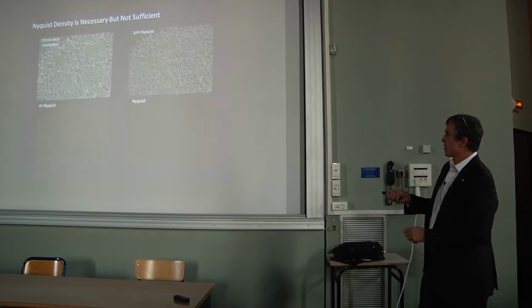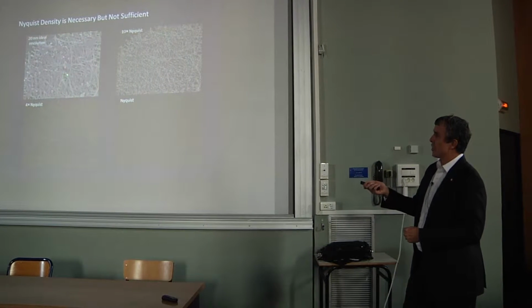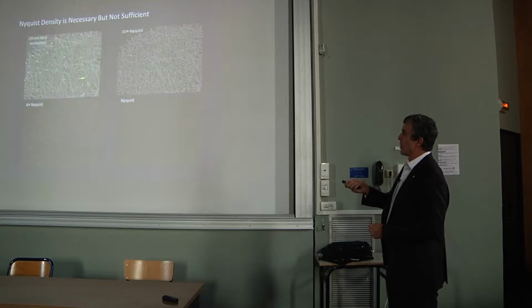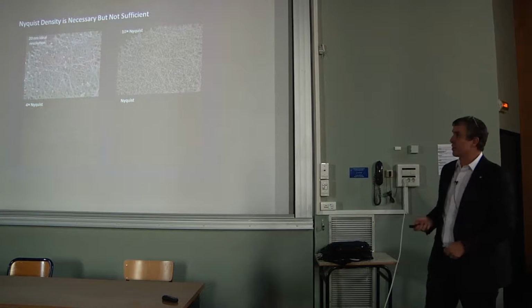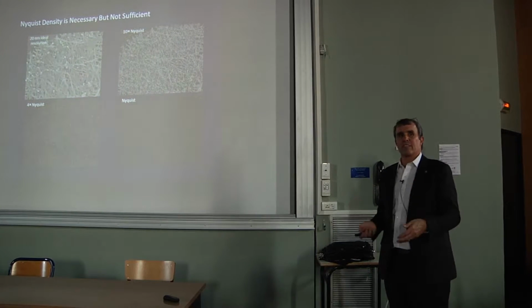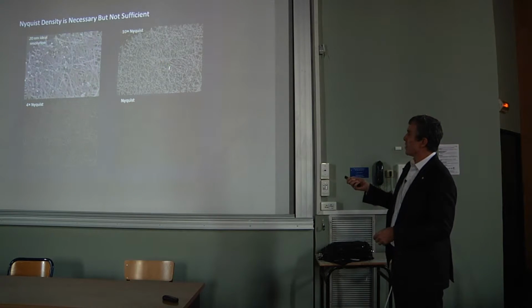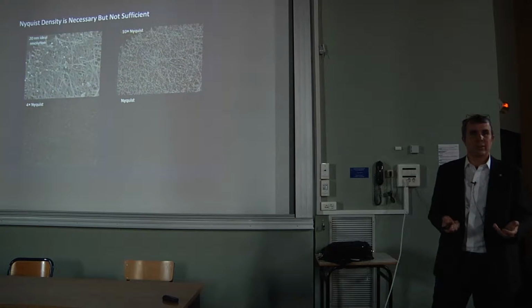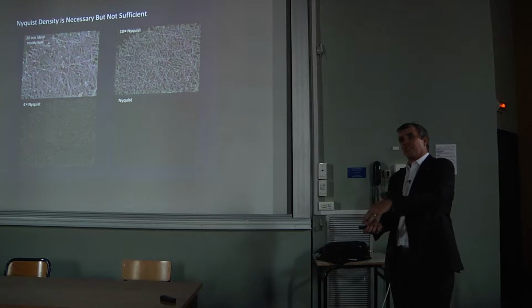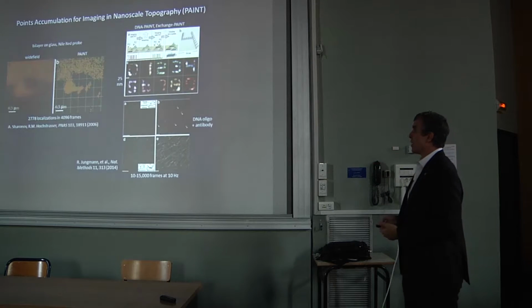So this is almost hopeless to see in this slide, but here's an electron micrograph in which we've blurred to about 20 nanometer resolution. If instead we start popping molecules onto the structure in another Gedanken experiment, if we do that at that Nyquist criterion, there's still so much stochasticity in where the labels fall that it's not a good enough criterion. You really have to go almost 10 times beyond the Nyquist criterion of labeling to really decorate the structure with high fidelity. And so that means it's not 500, it's 5,000. And it gets really, really difficult. It's doable, but it's really difficult to do that.